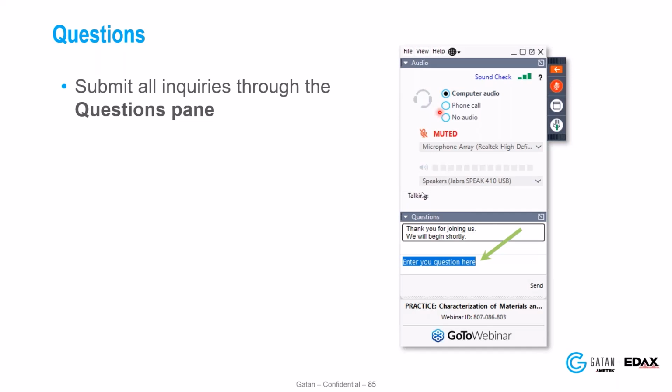Do you allow free use of students to analyze EBSD results with OIM software? At the moment, we don't have a student version or a free trial version. That is something we think about, but we have not implemented that.